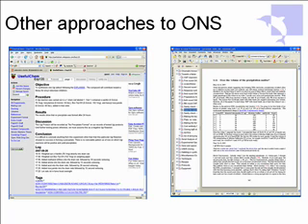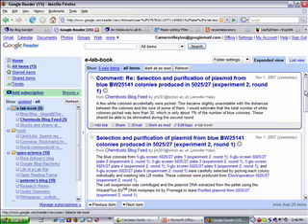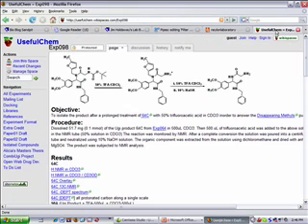But I think what's more interesting is the difference in how Jean-Claude's group and my group lay things out. So up here we have, what is that experiment? That's 135. So I think I've got experiment 098 here. So this is an experiment from the UsefulChem wiki. This is the final version. There's a couple of interesting things that I take from this. This is a version where it's now described in a sort of complete finalized approach. This is the experiment after all the analysis has been done, after everything's been explained.